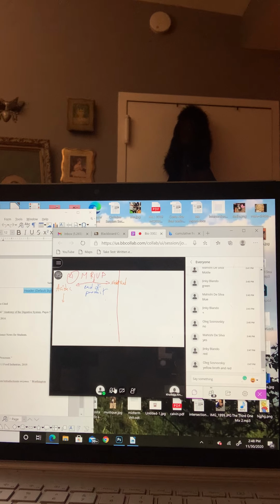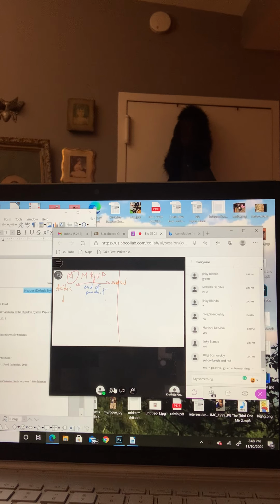So we talk about this, please, before. Just make a summary. So red positive, glucose fermenter, good. So we have here the E. coli. And for the neutral, which type of the bacteria? Give me one. The Enterobacter aerogenes, yeah?